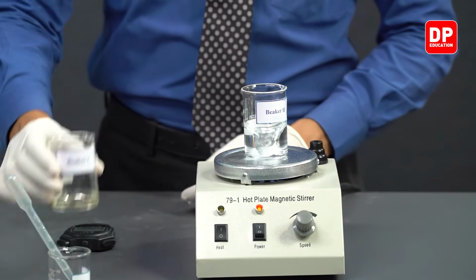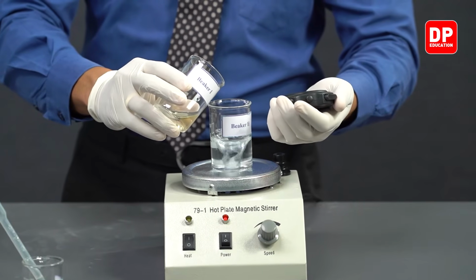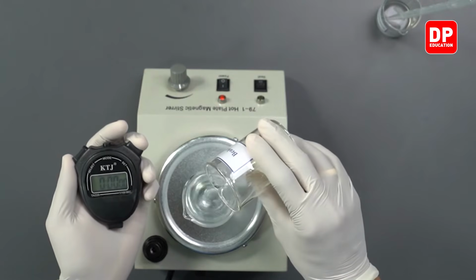So we have our beaker 1 containing our Fe3 plus ions, and we are going to start the stopwatch as we add this into beaker 2.